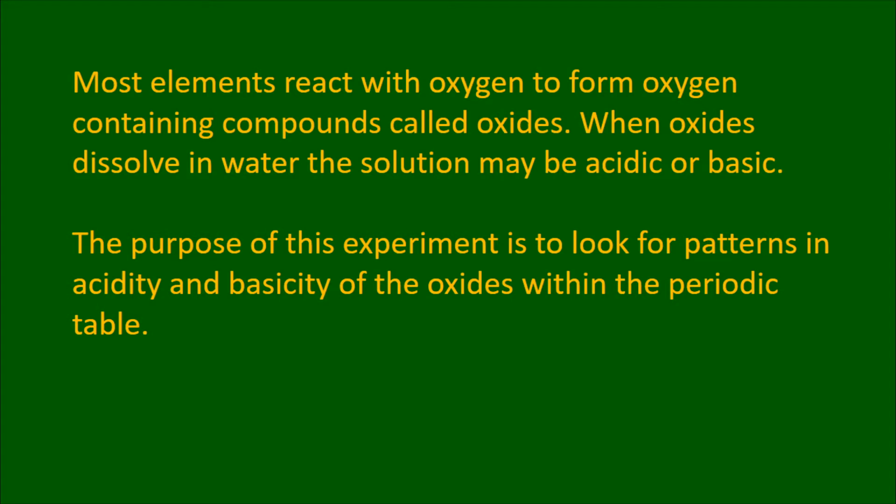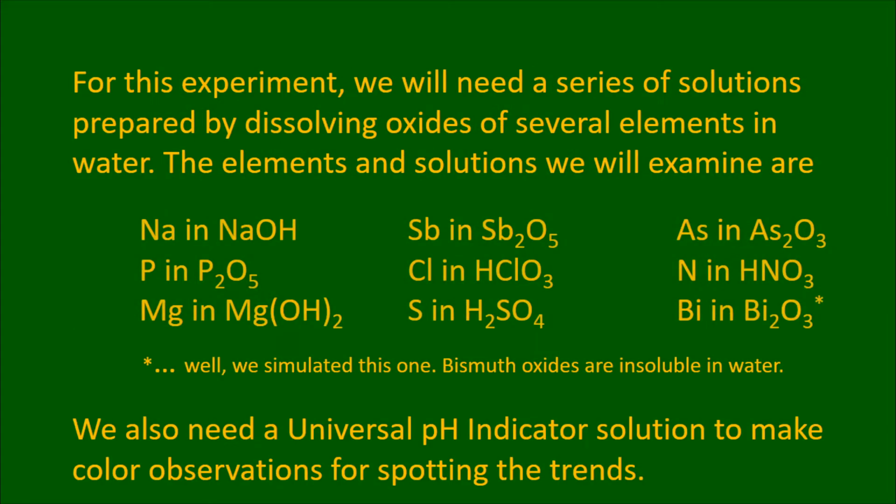Most elements react with oxygen to form oxygen-containing compounds called oxides. When oxides dissolve in water, the solution may be acidic or basic. The purpose of this experiment is to look for patterns in acidity and basicity of the oxides within the periodic table. For this experiment, we will need a series of solutions prepared by dissolving oxides of several elements in water.